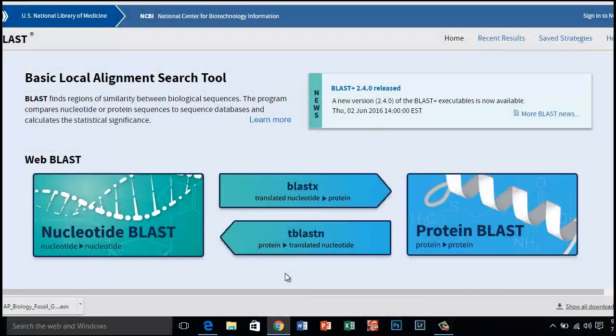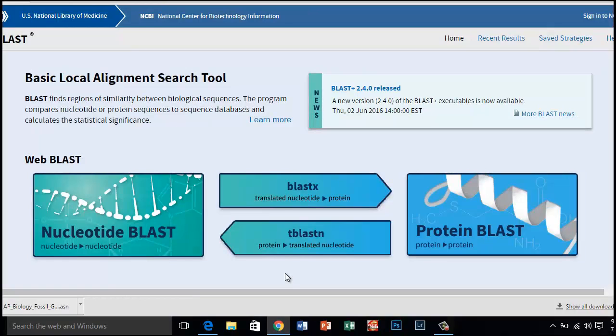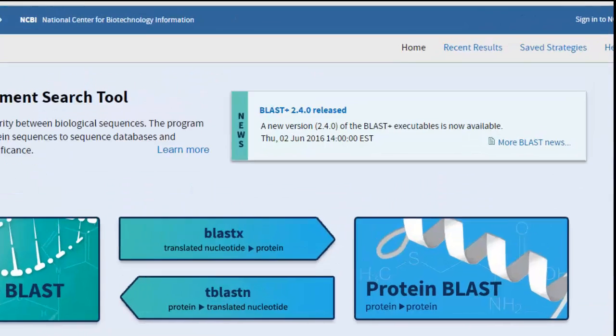Now that all the gene files have been downloaded, you need to access the BLAST website. I have placed this link on the Google Drive. Once you click on the link, you should be at the BLAST home site.